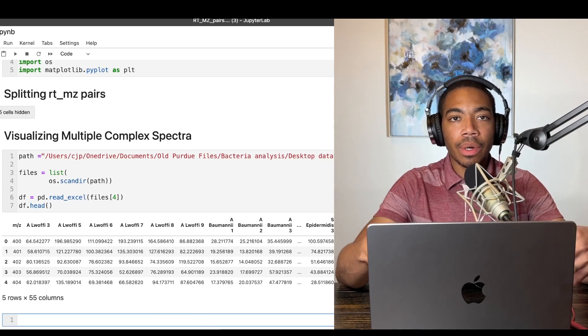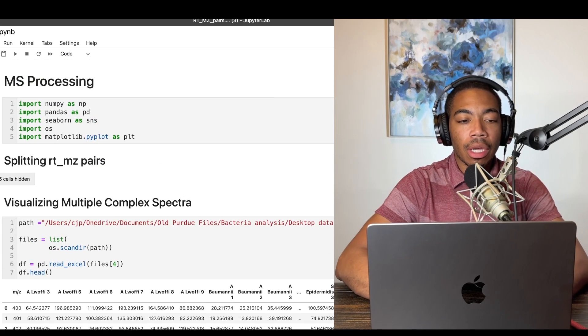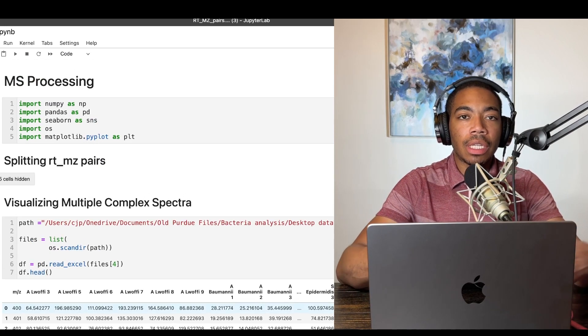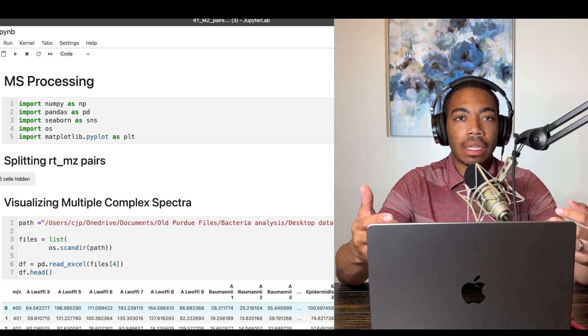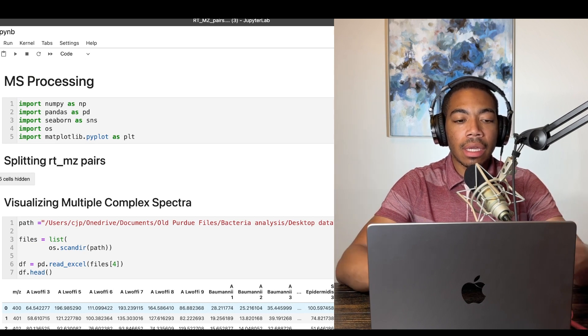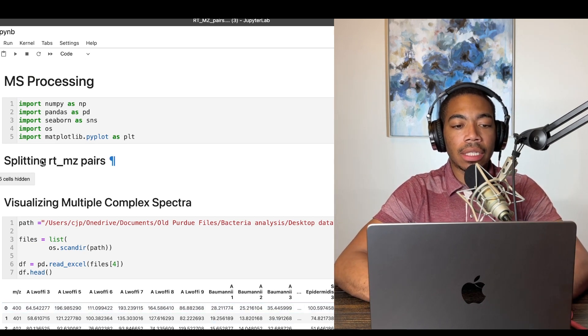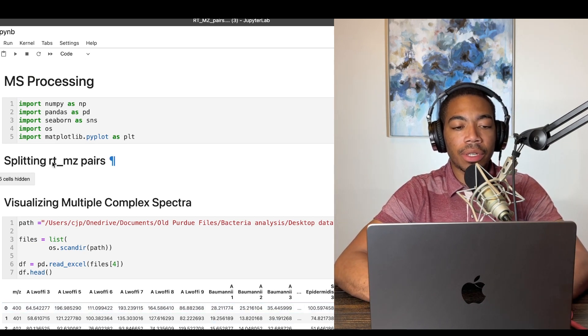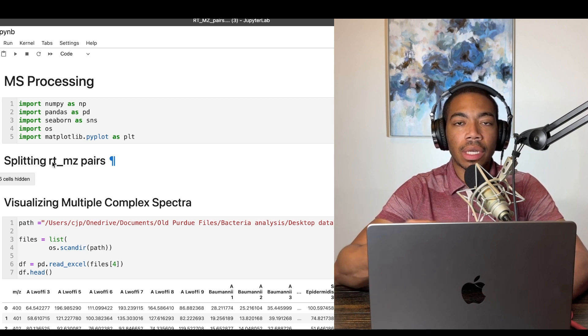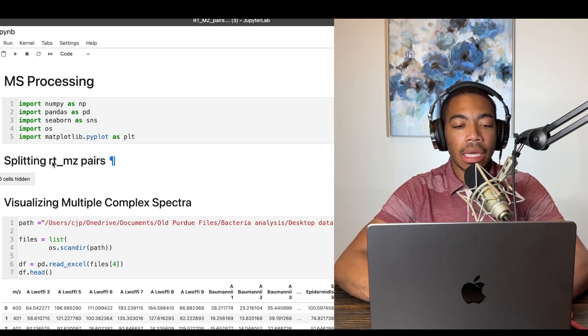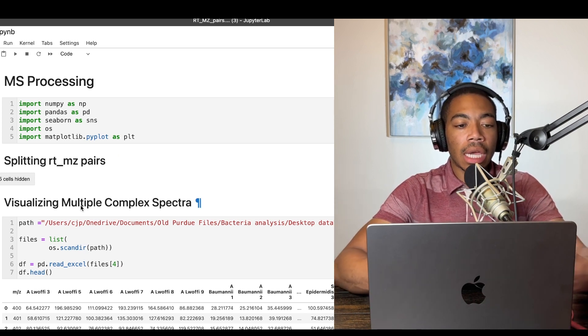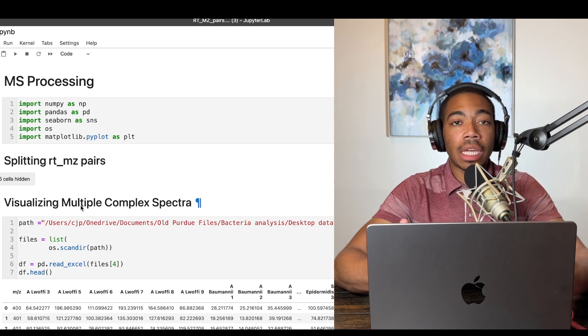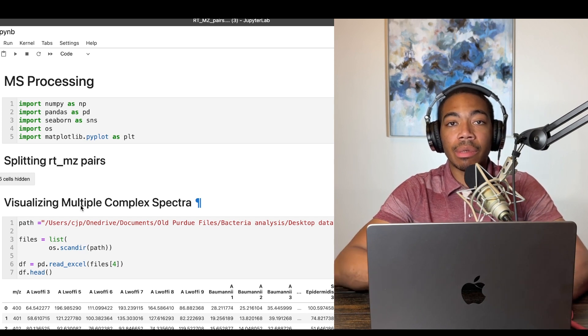Welcome back to the channel. In today's video, I want to go over another data processing tip, particularly when you're dealing with mass spec or other complex analytical data. And in the first video, we looked at splitting retention time over the pairs when they're stored as a single column. And now in this video, I want to go over how we can visualize multiple complex spectra.